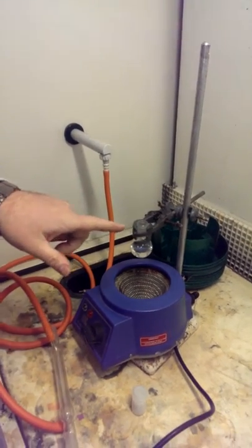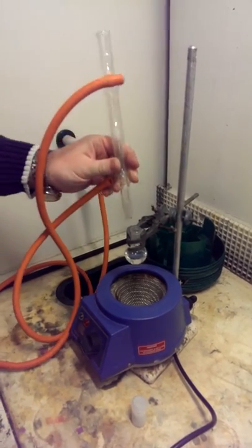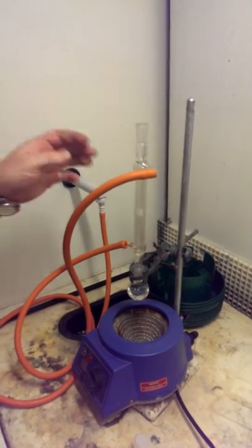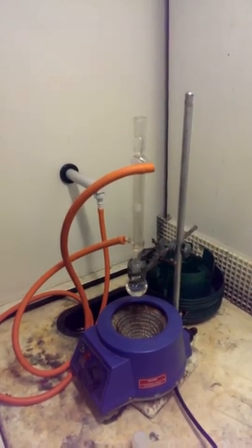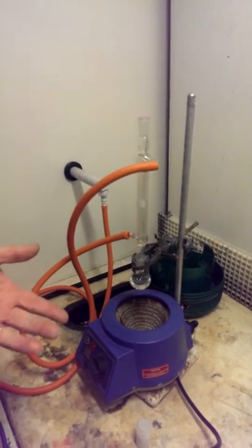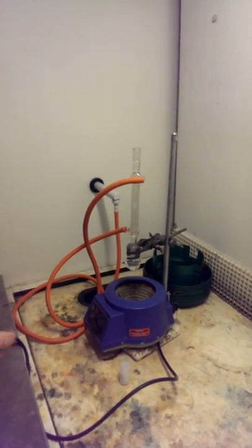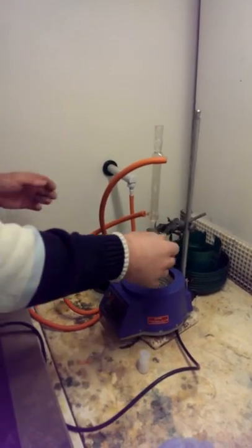So make sure the joint, the neck of the flask, is clean, because if not, and you're putting a condenser in a glass joint and you're refluxing, essentially you're cooking the glass joints together, so it would be very hard to release later on in certain circumstances. Right, so we're happy with that, the neck has been cleaned.